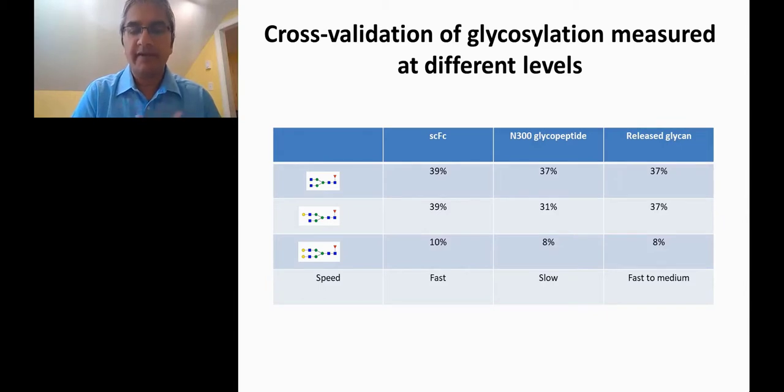The reason for doing this is that if we want to build these types of correlations for different biopharmaceutical products, so that we can develop in-process control, we can still rely on the fast method because we now have a robust understanding that the rank ordering of these glycans is preserved across the various layers of analysis. Whatever changes or differences we can pick up with either a process change or something happening as an in-process control, we can use these fast methods to detect them and develop them as important methods for process development and process-product correlation.